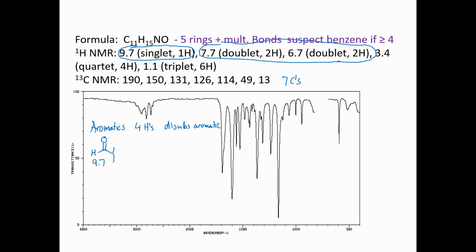All right, we see a lot of symmetry again in the aromatic ring system here. We see 2 doublets, okay? And this is consistent again with the para disubstituted system. Okay. All right. Our aldehyde isn't going to have any coupling, so let's just put it right here. All right. So we have the structure.